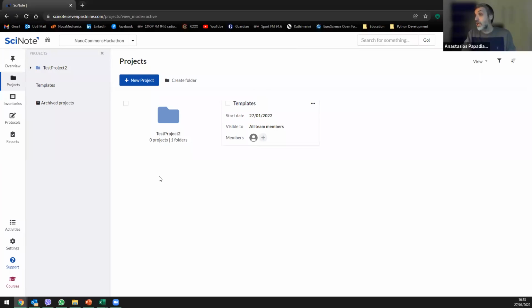And yes, thanks, Thomas. You're right that the permanently delete function is something that can be deactivated in the system. It's a good thing to have it in a training instance, but for data transparency reasons, it would be best to deactivate it in a working environment.